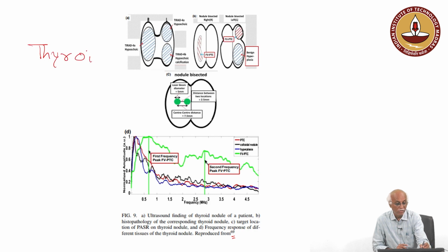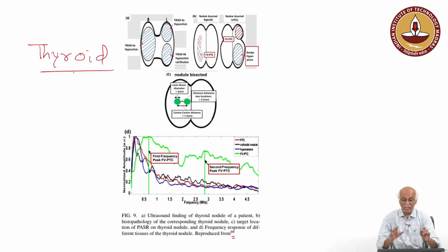thyroid gland. Of course, this experiment is not performed on a human being, but on an extracted thyroid gland. That thyroid gland in some region has maybe carcinogenic tumor or tissues, etc. So, the thyroid has different regions, and a 532 nanometer green laser is used to interact with such tissue samples.